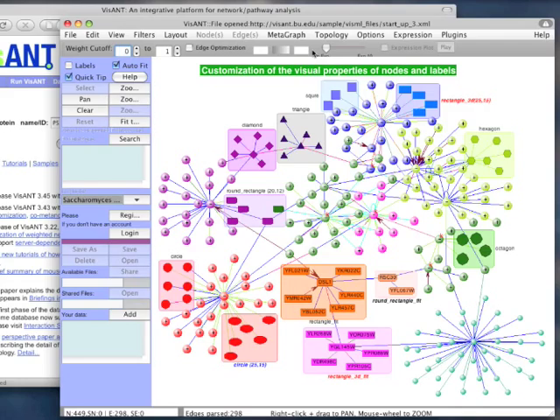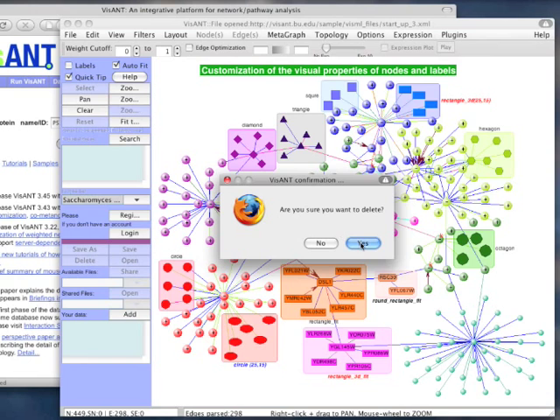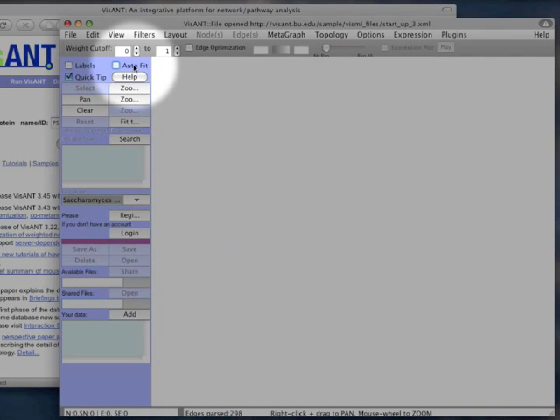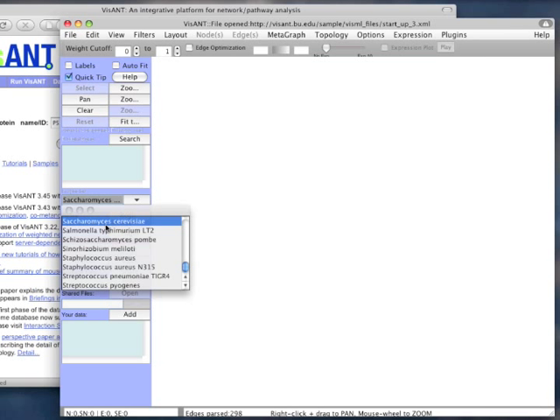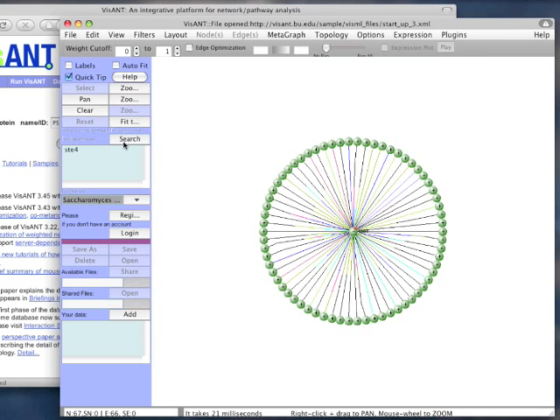The first step of the tutorial is to clear the network, so that we can load one of our own choosing. We're going to turn off AutoFit, as it says in the instructions, and make sure that we are looking for interactions from the yeast database. Start by searching for the gene STE4. This will give us a diagram showing all of the interacting genes.